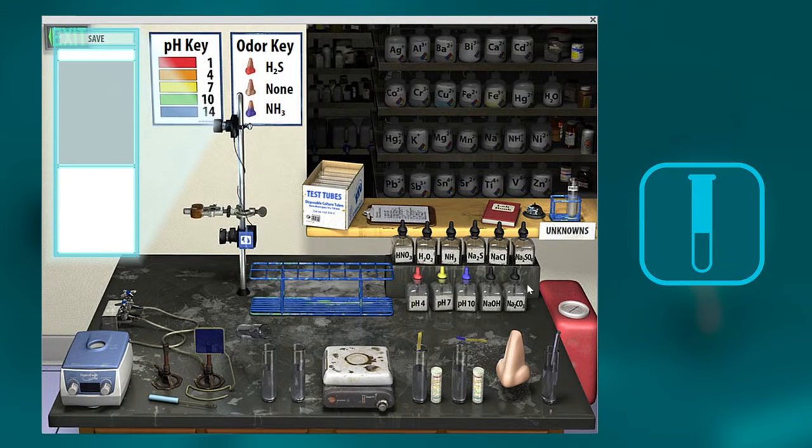You can repeat this experiment with as many different cations as you want, right? You can put what you need in these test tubes, keep testing so you are fully ready to do qual analysis in the lab. We hope this helps.